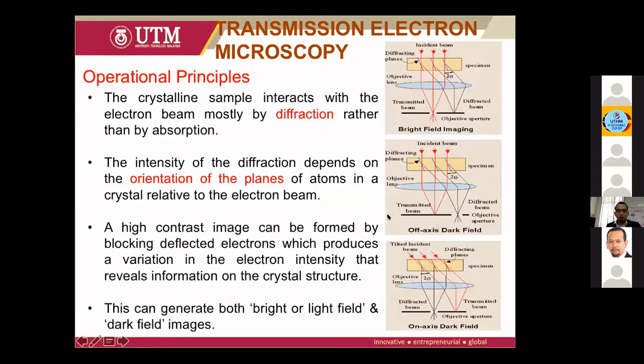Okay, so this is what I mentioned earlier on the degree of angle, whether you are going to have a bright field imaging or a dark field imaging. It is based on how you tilt the incident beam. If your sample is really dense, maybe you have to optimize on this. This requires special training also.